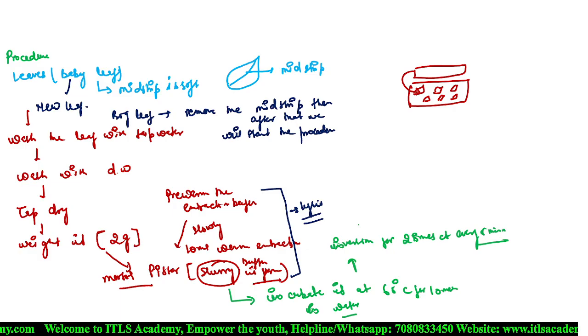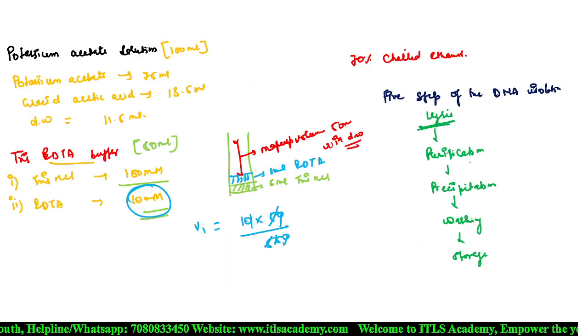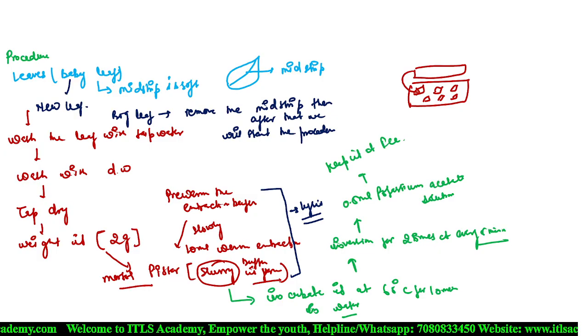Then after that, you have to add 0.5 ml potassium acetate solution. This solution is potassium acetate solution, okay? And keep it on ice for 10 minutes.